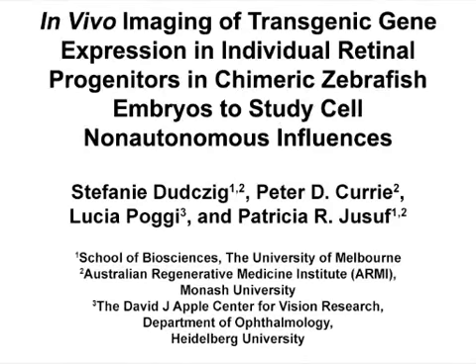The overall goal of these procedures is to study how changes in gene expression, either within developing cells or in their surrounding environment, influence temporal processes during development. This method can help answer key questions, such as whether the timing of fate specification is controlled by genes expressed cell autonomously within a cell or cell non-autonomously in neighboring cells.